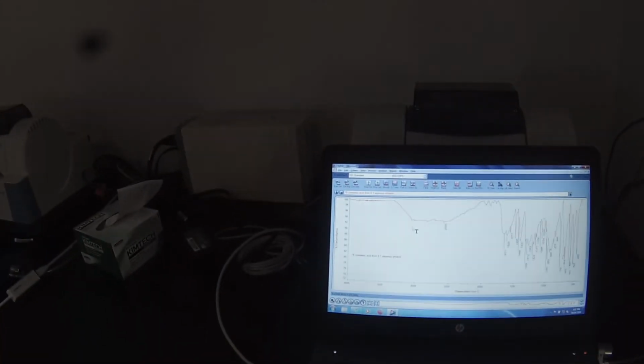Kind of curious as to what those are, so I'm going to use the T to label those. And by holding the shift key down, I can make sure it finds the center of the peak. So we've just got really a broad blob all the way from about 2100 all the way out to about 3100, which is pretty common. And now I can just move these guys. Right, so you can see that it's pretty messy.